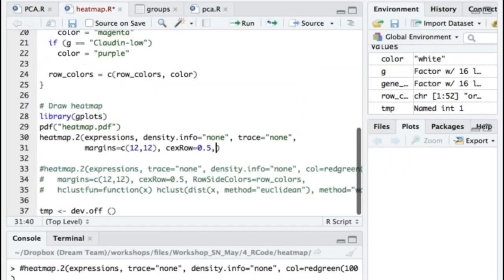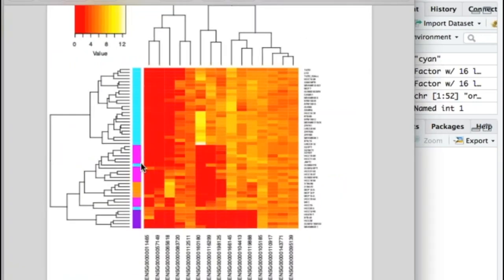So, yes. One more thing there: remember we set the linkage type to ward.D. Let us see now, let me run this. We see that there is some not-perfect reordering. You see that this group is split by the orange group, and there are two luminal types.